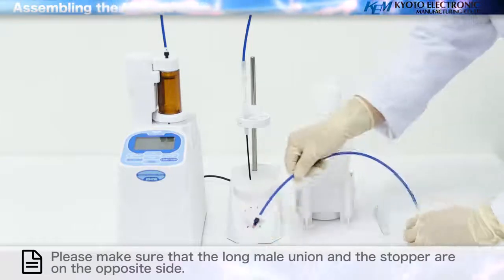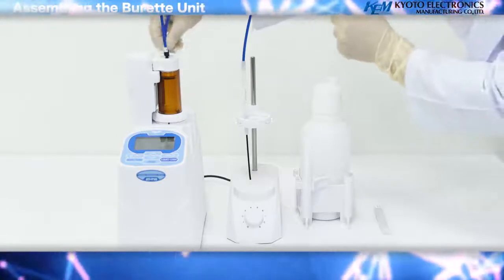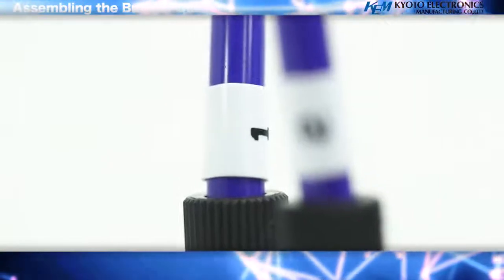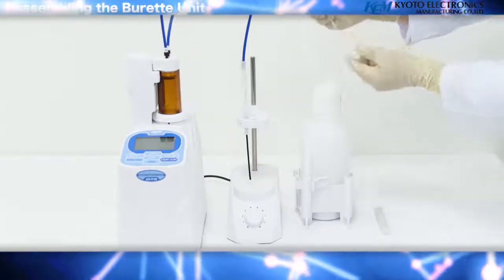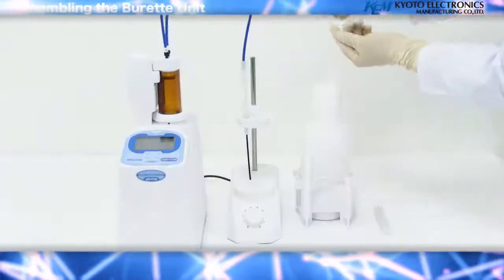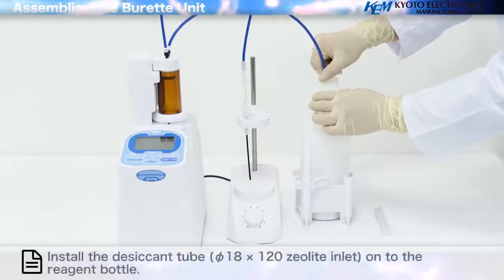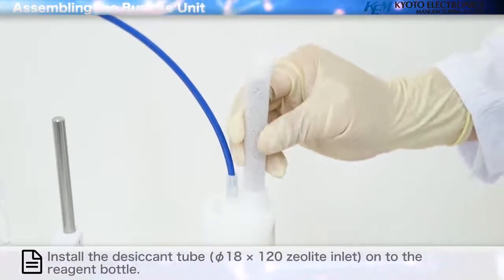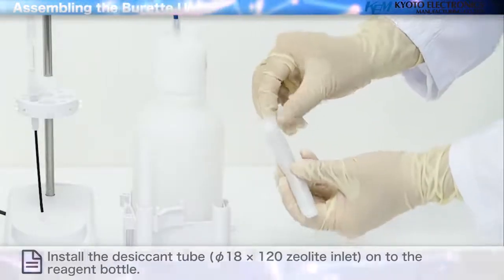Tighten the connecting tube to the number one position of the switching valve. Tighten the electrodes. Align the tube to a position that ensures it can reach the bottom of the reagent bottle. Install the desiccant tube onto the reagent bottle, and remove the seal of the desiccant tube.